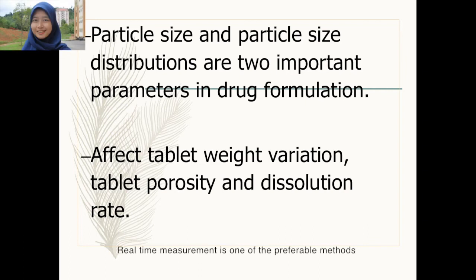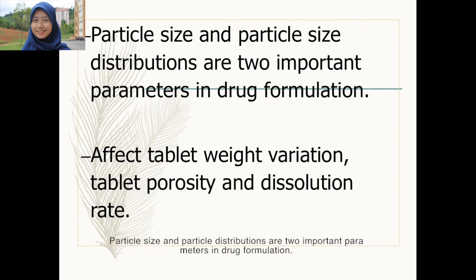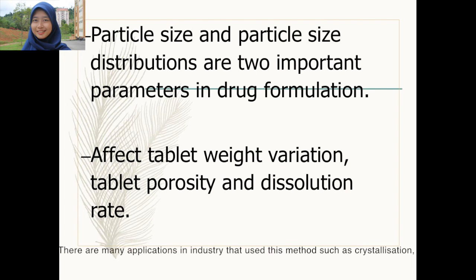Real-time measurement is one of the preferable methods to measure granule size as it is not time-consuming and can measure a wide range of particle sizes. Particle size and particle distributions are two important parameters in drug formulations. This is because they can affect tablet weight variation, tablet porosity, and dissolution rate. There are many applications in industry that use this method such as crystallization, coating, semi-solid formulation, and granulation.